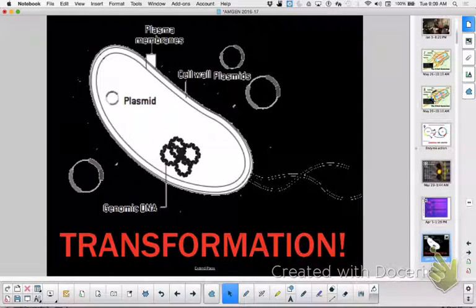Yes. So if we're putting the pARA gene into the bacteria, doesn't that mean we're also making it resistant to ampicillin? It does. Now, we're adding the red fluorescent protein along with the P-BAD into the pARA, right? And that is one of the ways, because bacteria will grow on anything, so we will have controls when we plate out, and some will plate with no plasmids in them at all on straight up Luria broth, which every single bacteria loves.